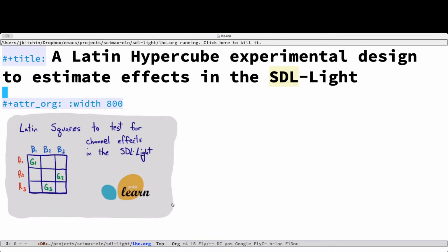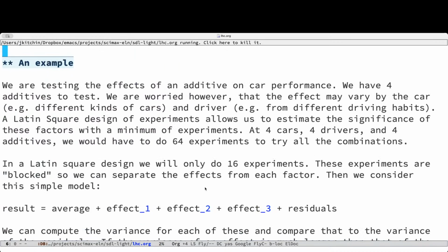There is surprisingly not a good Latin hypercube package in Python. There are things in SciPy that do Latin hypercube sampling, but that's not the same as this. There is a Latin hypercube design in PyDOE3, but it's also not this. And I couldn't find something else and wanted to have this for general capabilities. So let me show you how I have it set up.